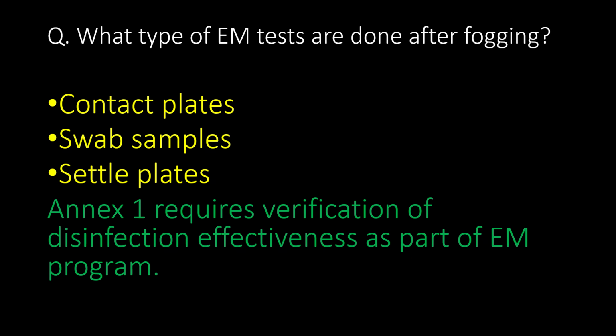What type of environmental monitoring tests are done after fogging? Contact plates, swab samples, settle plates. Annex 1 requires verification of disinfection effectiveness as a part of EM, that is the Environmental Monitoring Program.